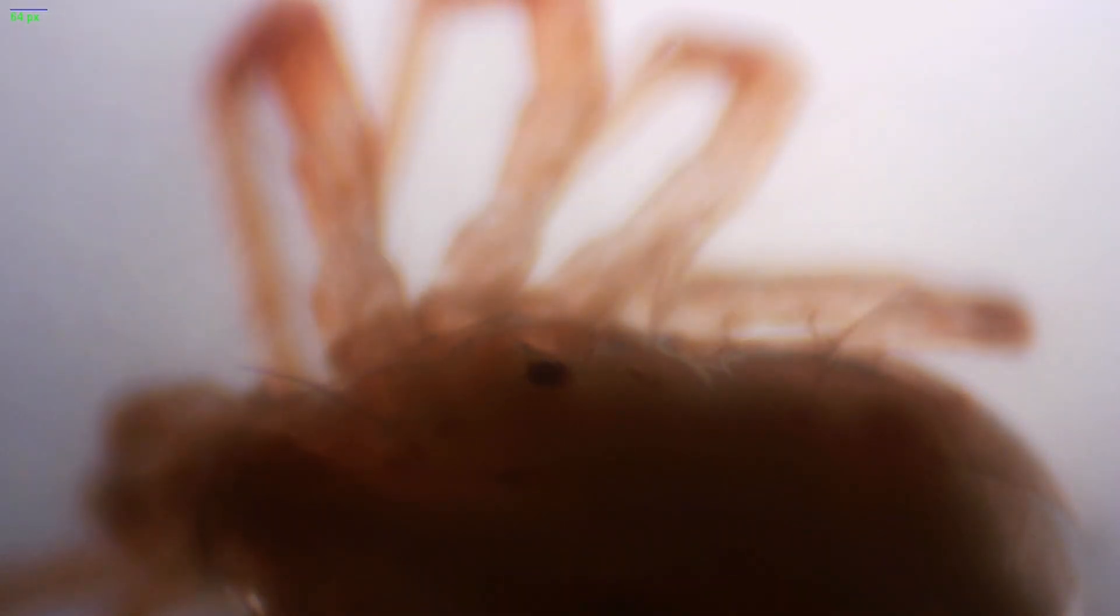Now I am not sure if that's what those are so don't quote me on it but I know that mites do have light receptors and sometimes they're on the bottom of the mite and sometimes they can be on the top. So I don't know if this is what these are. So don't quote me on that.